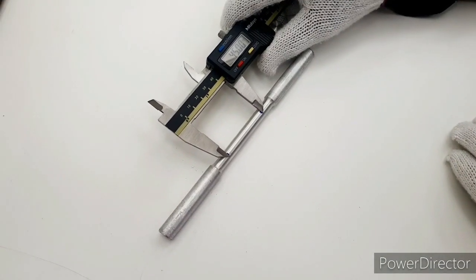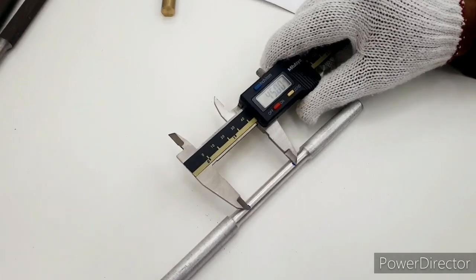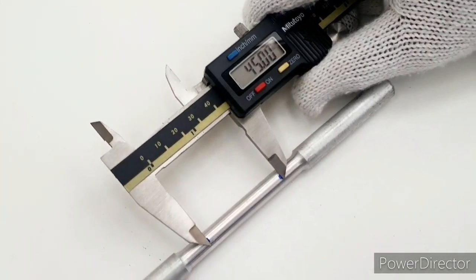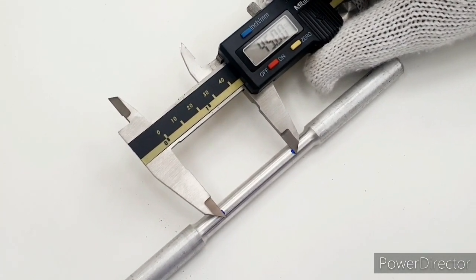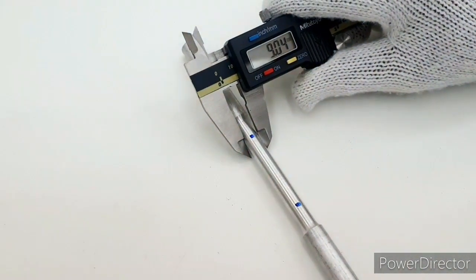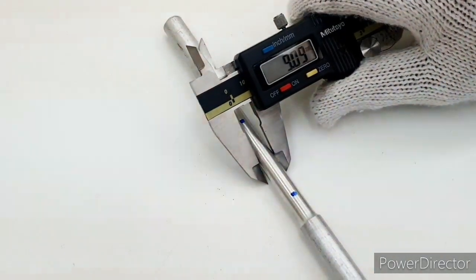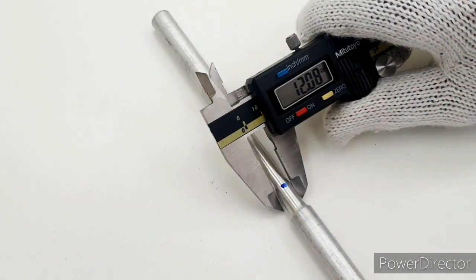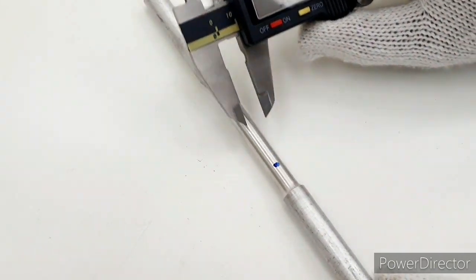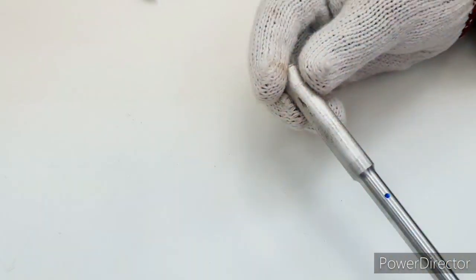In the tensile test, now we will look at how the aluminum sample will behave. First, we will measure the initial length of our aluminum sample, which is 45 millimeters. Also, we will measure its diameter, which is around 9 millimeters, from different locations: 9.06, 9.04, 9.09. So let's assume it is averagely 9 millimeters.